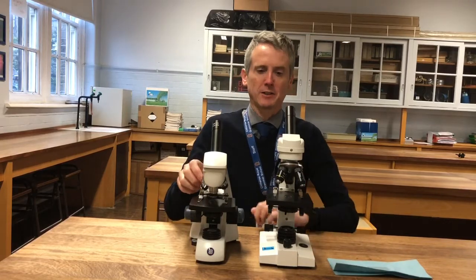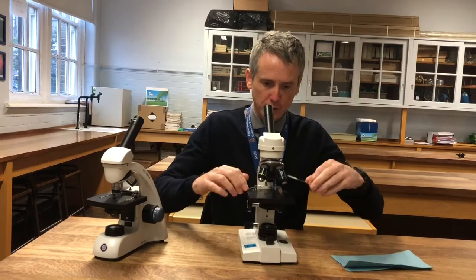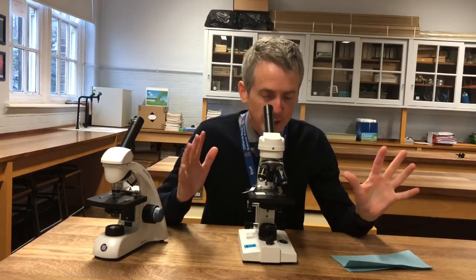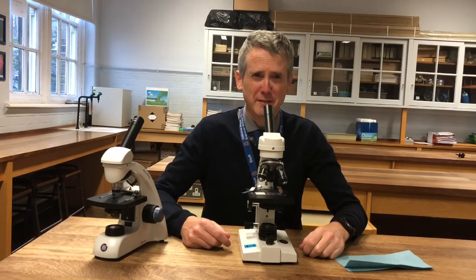What a lot of students think when they use a microscope is that they can take a slide, pop it on a microscope, and it will magically be perfect — like you see on TV and films.